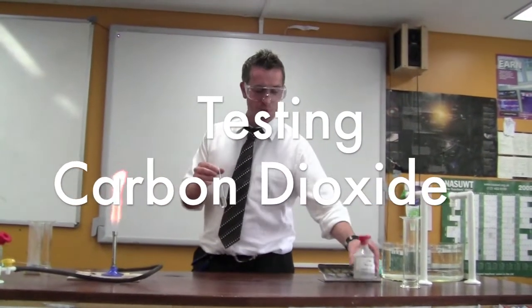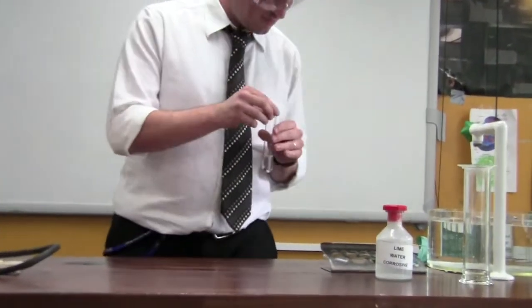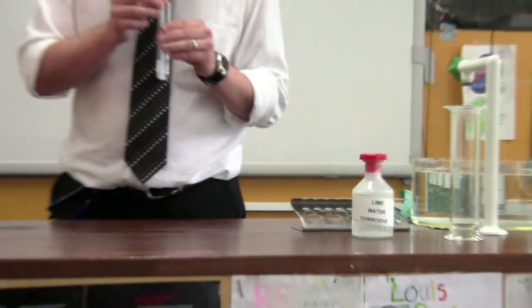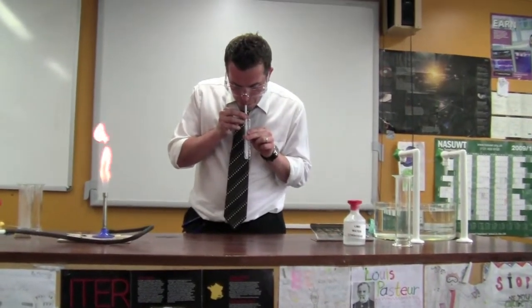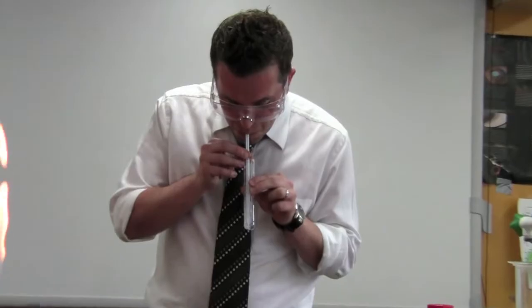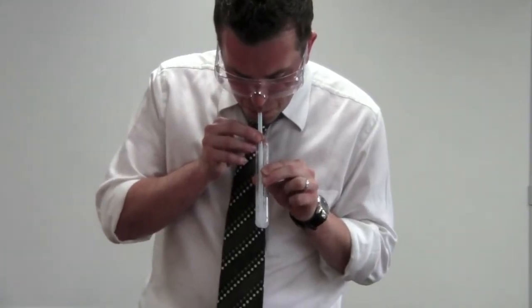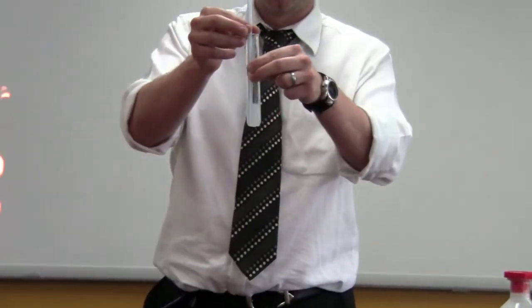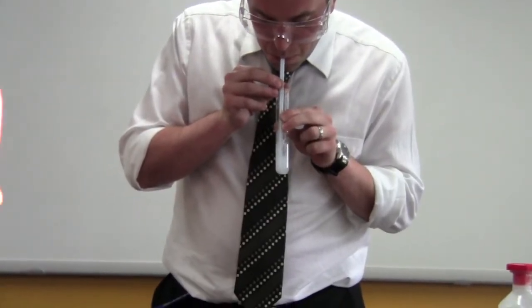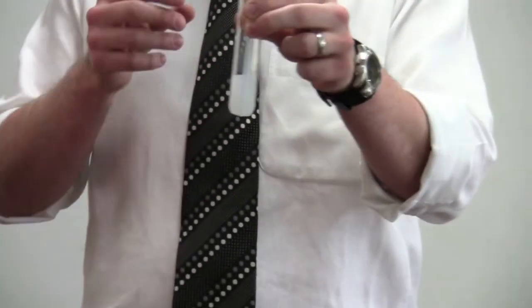Another test for carbon dioxide is lime water. As you can see, the lime water has turned cloudy — a positive test for CO2.